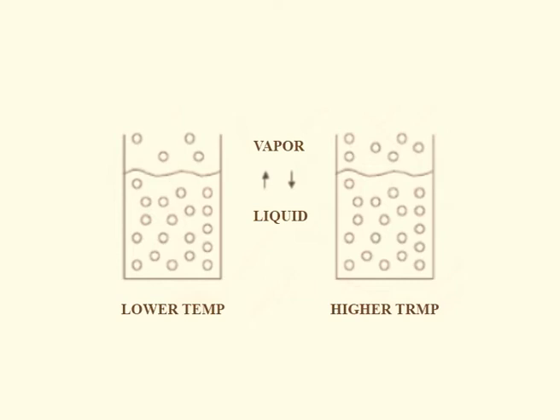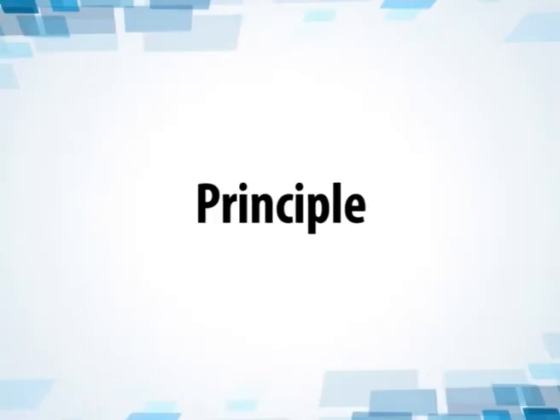If the liquid sample is present in a closed container with an attached pressure gauge, degree of vaporization can be obtained quantitatively. This pressure is referred to as vapor pressure of the component, and this can be measured at different temperature values. Now, with this understanding of distillation process, let us now move to the principle of distillation technique.